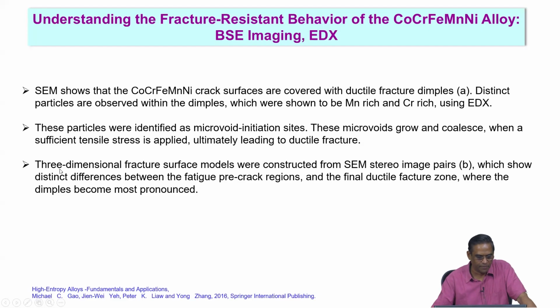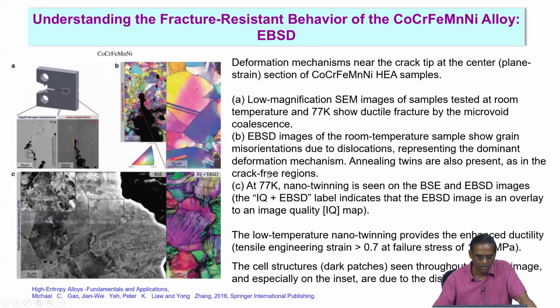And 3-dimensional fracture surface models were constructed from SEM stereo image pairs, which show the distinct difference between fatigue pre-crack regions and the final ductile fracture zone, where the dimples become most pronounced. I will explain all these 3 points one by one. So look at this interesting image.